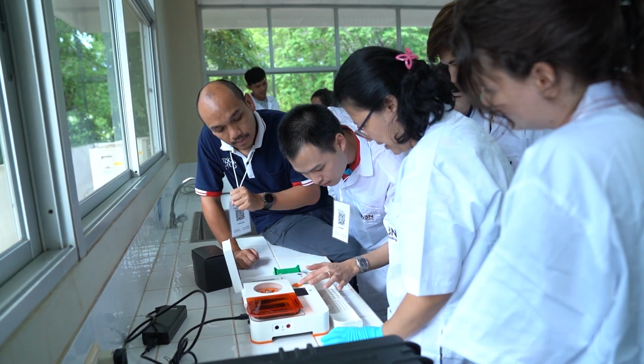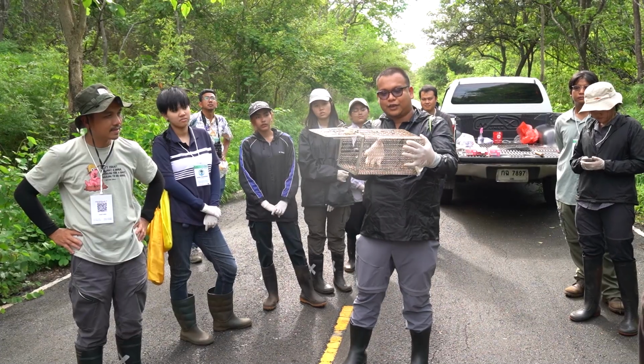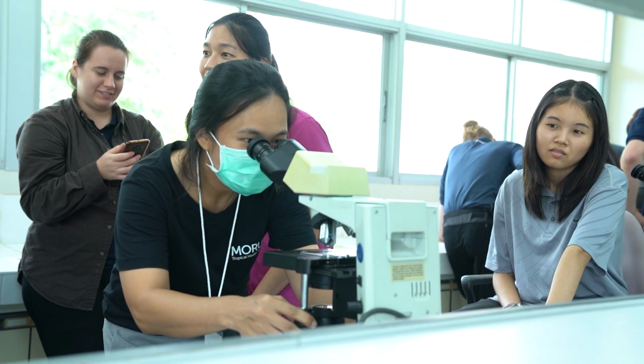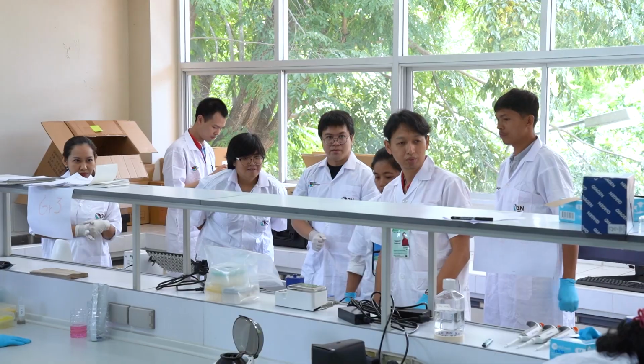So the next workshop, we will focus on data application and data visualization, like how to use the genomic sequencing that we have in the lab and do visualization, to utilize those genomic sequences to let people, like public health people, understand the results and use the results for disease surveillance.